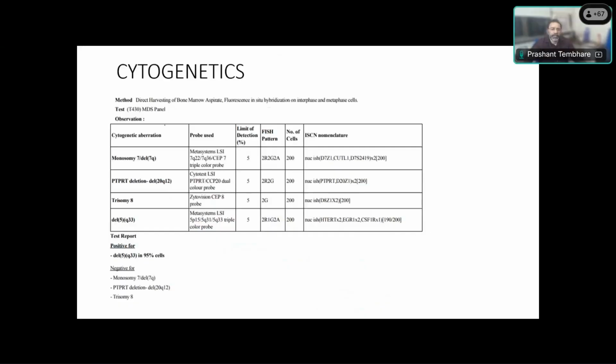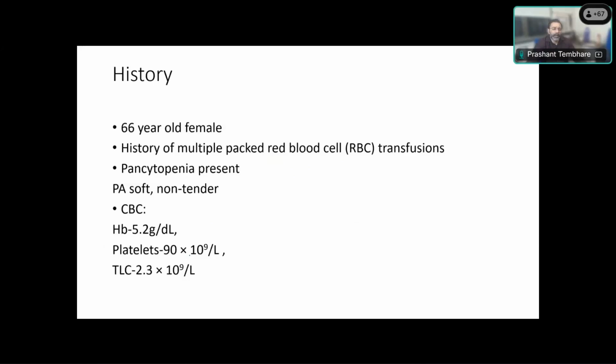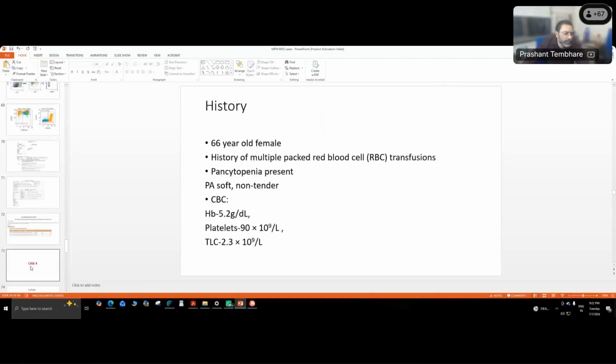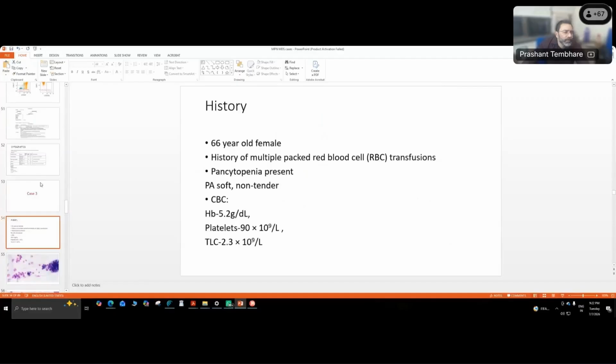And you can see in this patient, we had 5q deletion in 95% of cells. Okay, so that was a case of MDS. This is another case. Okay, there are 4 cases.